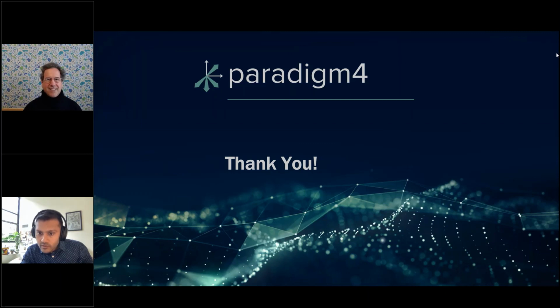So does data have to come to Paradigm in an ADF format, or are they converting data from instruments into ADF? It would come from the ADF. So we had a nice proof of concept experiment with Lawrence Berkeley National Labs, which was very early on in Paradigm 4's history, where we demonstrated we can actually read the data portion of the ADF.